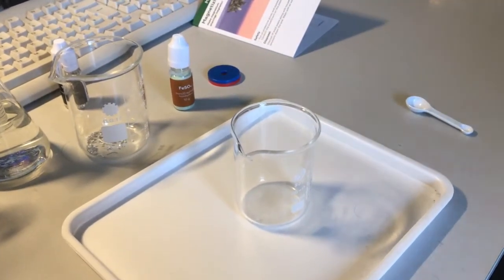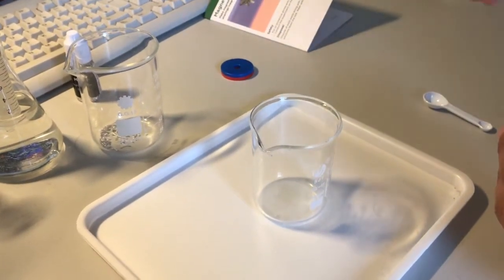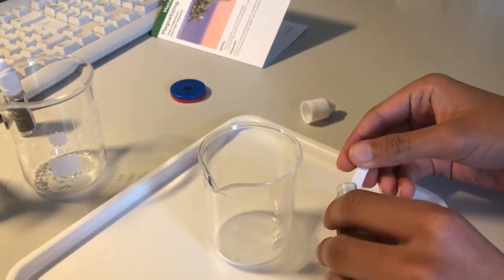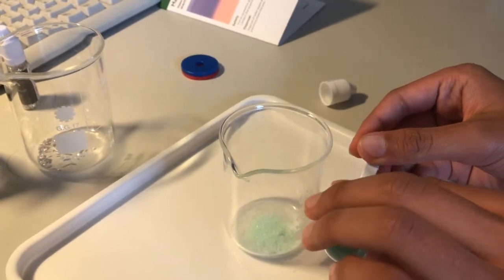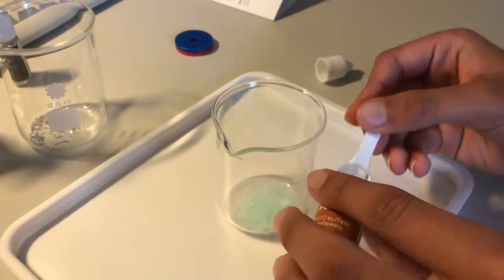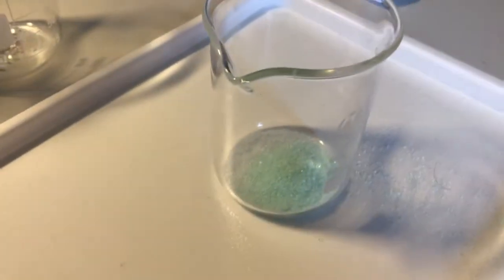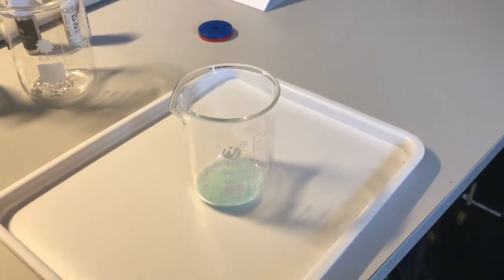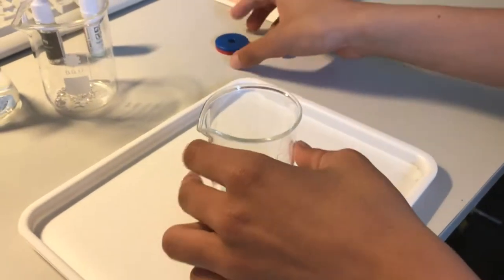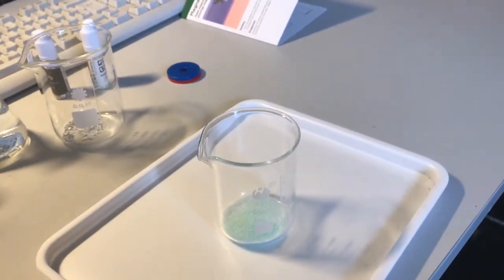We now place three spoonfuls of iron sulphate into a separate beaker. We then place the beaker on top of the magnet to see if the iron sulphate is magnetic. Again, the magnet doesn't appear to have any reaction on the iron sulphates.